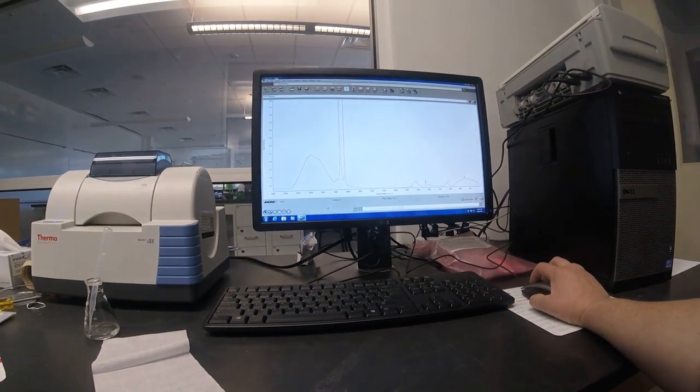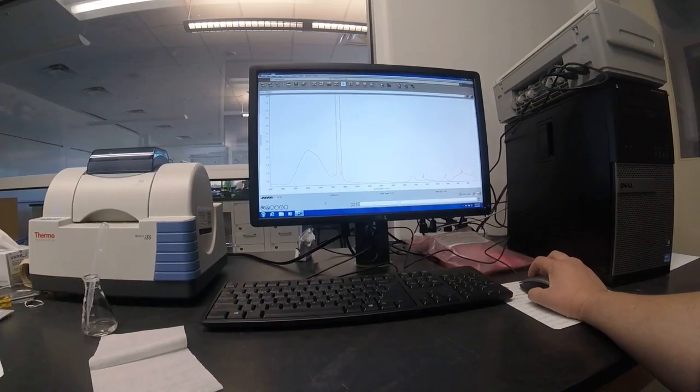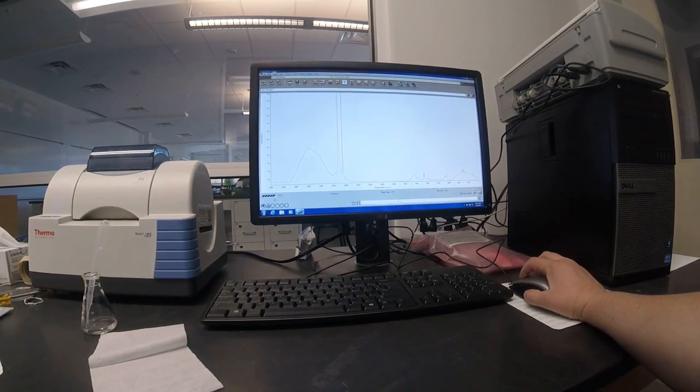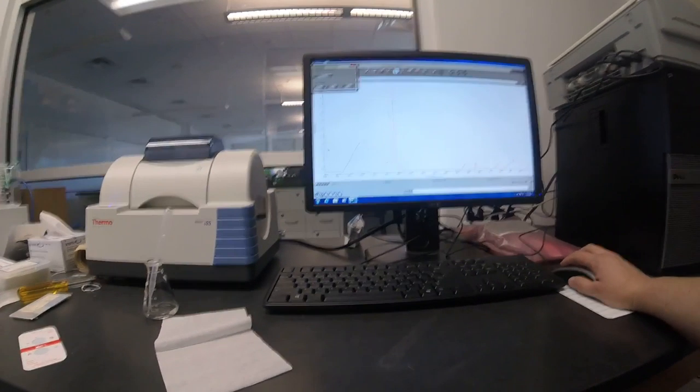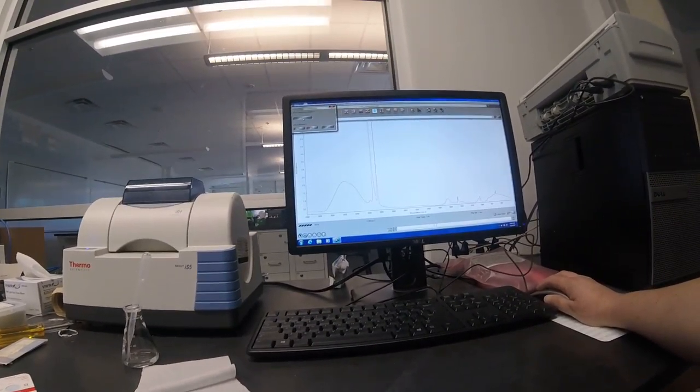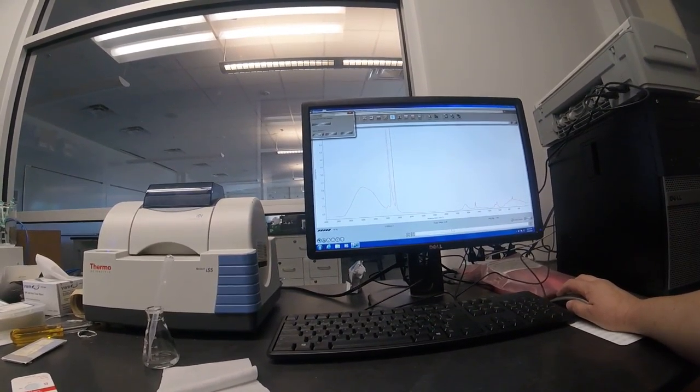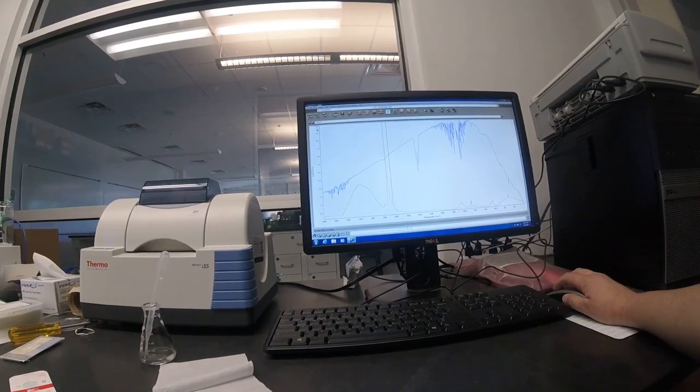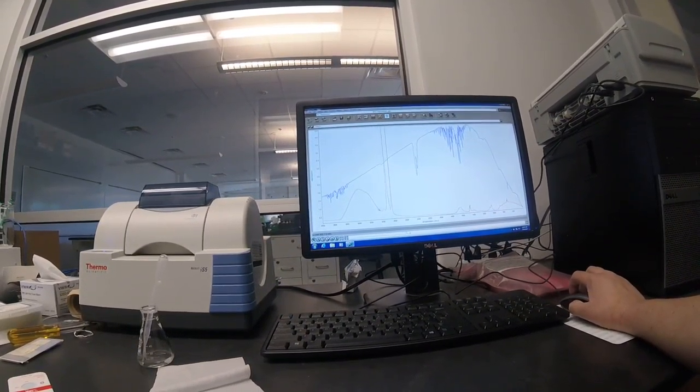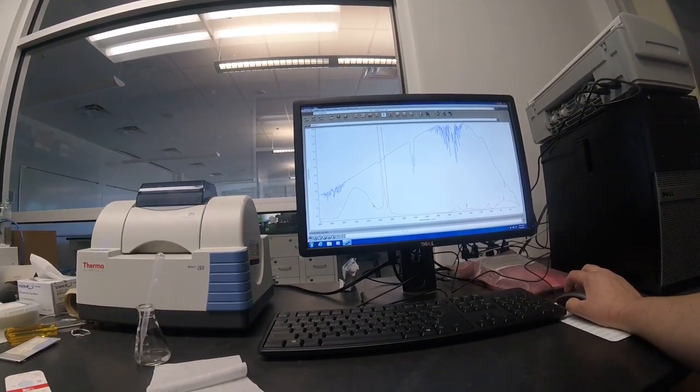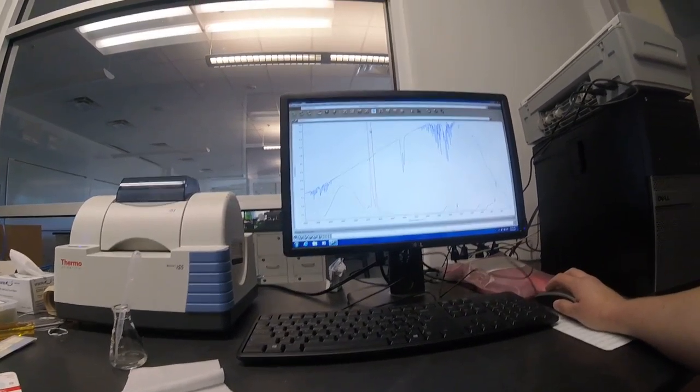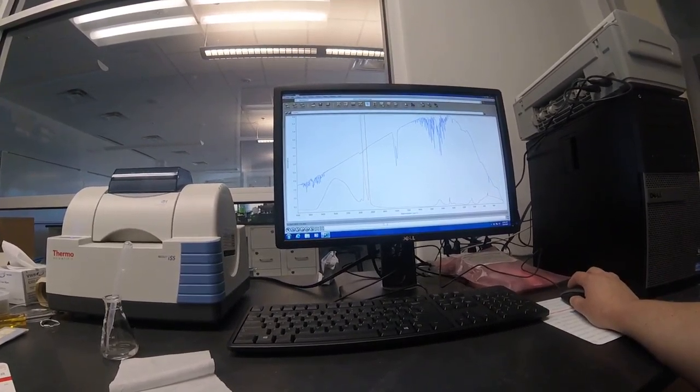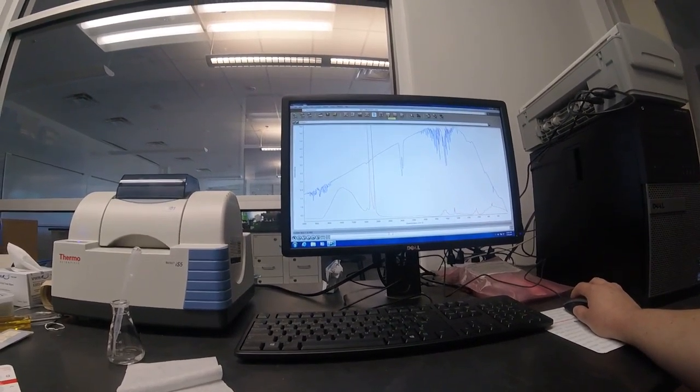And then once you have your sample complete, you've collected your sample, you can see that it collected your sample. You can view that, but you could also add it to the window. We added it to the window and it added so beautifully.